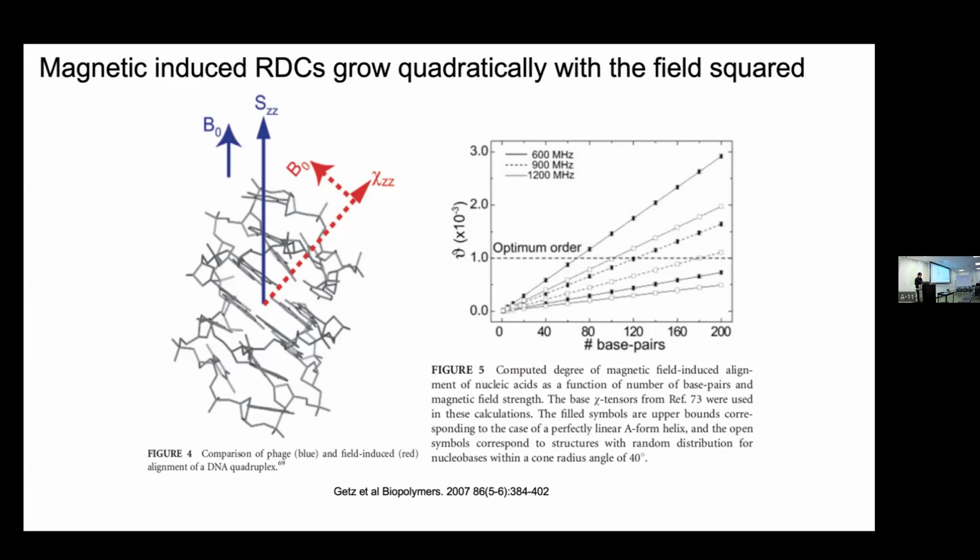So it's really substantial. Now, if you have a protein that binds your DNA, by the way, 40 base pairs is still big, and it's going to be a rigid duplex. The signal is not going to be great, even after we site label it. And if you increase temperature, the alignment goes down. It's like the Boltzmann bias decreases.